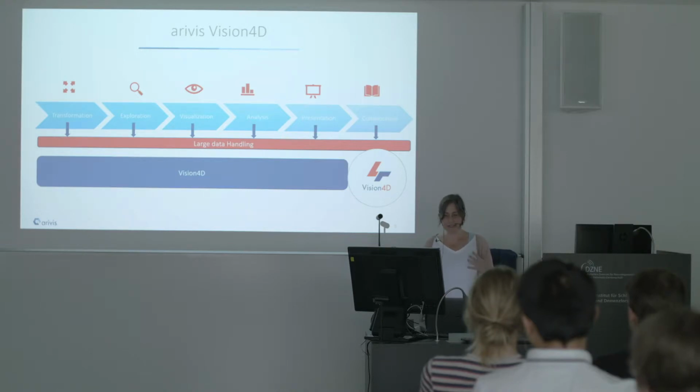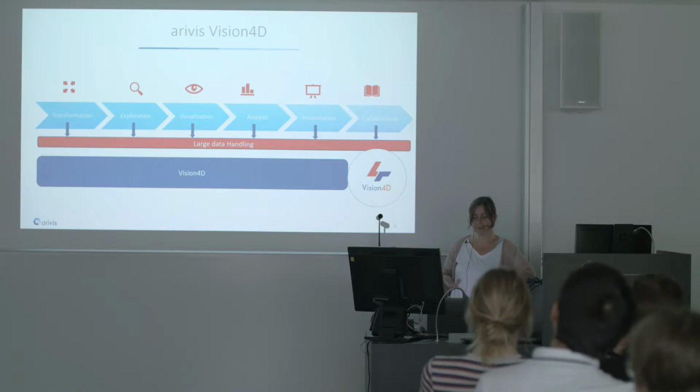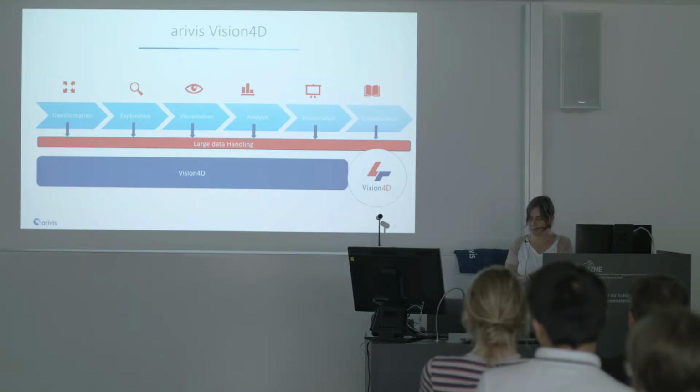So basically, even though that might not be in your first thought when you think about software tools to aid in the imaging pipeline, to provide an interactive preview at all steps will be vital as soon as you start light sheet microscopy. It might not be of relevance on small confocal subsets, but here it's really crucial for your workflow.